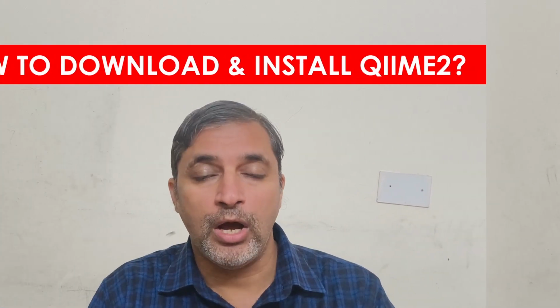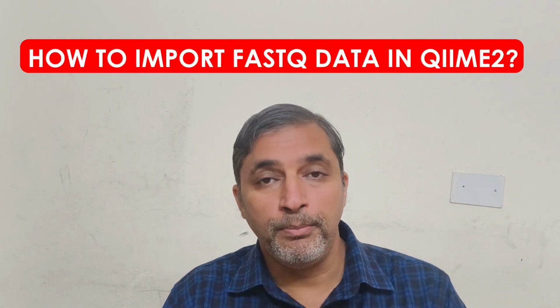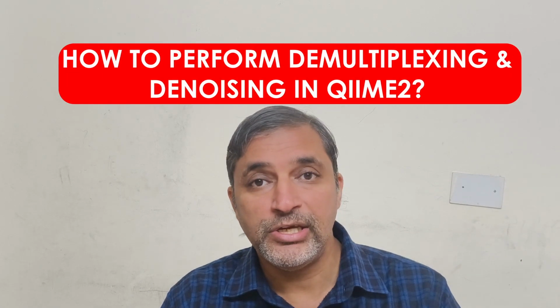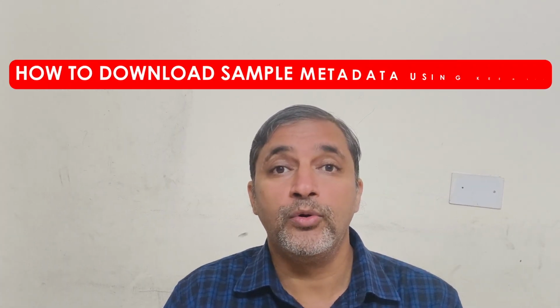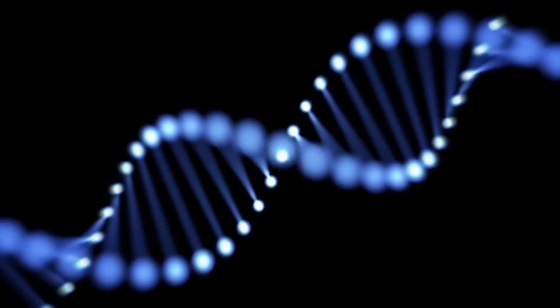In our ongoing QIIME2 series, we have so far learned how to download and install the QIIME2 environment on your system, how to import FASTQ data into your QIIME2 environment, followed by how to perform demultiplexing and denoising using the DADA2 tool in QIIME2. In addition, we have also learned how to download sample metadata files and validate them using QIIME2's Keemei tool. In this video, we are going to learn how to perform taxonomic classification using QIIME2. So without any further delay, let's start today's video.